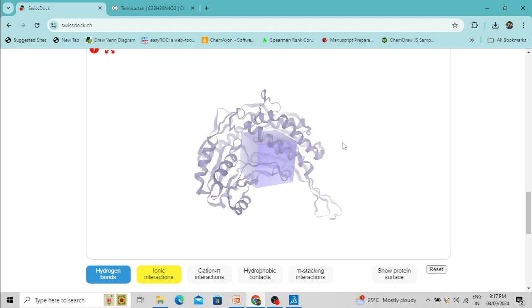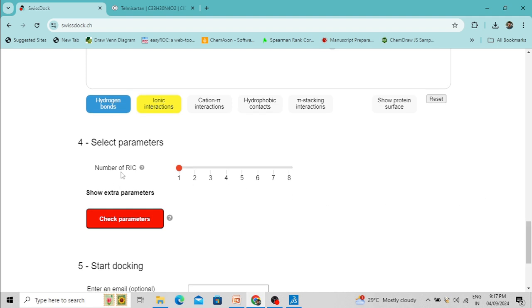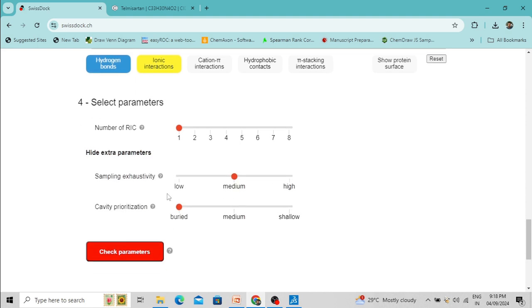The box is now surrounding the active site cavity. Now select the docking parameters. You can see 'Number of RIC', which stands for Random Initial Condition. If the initial conformation of your ligand and protein molecules differ, it can have an impact on the docking result. The default value is 1, but you can increase it up to 28.